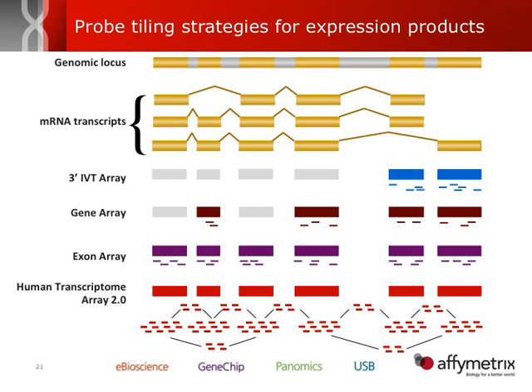We'd have signal coming from the probe set that interrogates exon number 3, but no signal from the probe set that interrogates exon number 2, because that exon is being spliced out. That exon is not being retained, so we wouldn't expect to get any signal. So there's our first level of information. That's telling us, okay, there's something going on here at the exon level that I might want to look at.